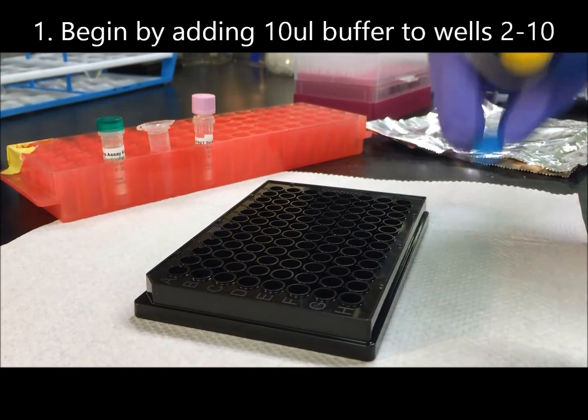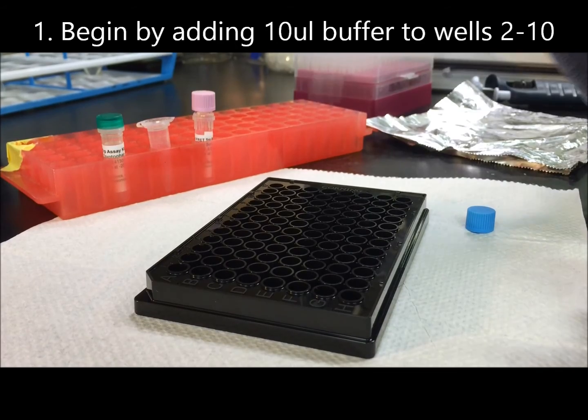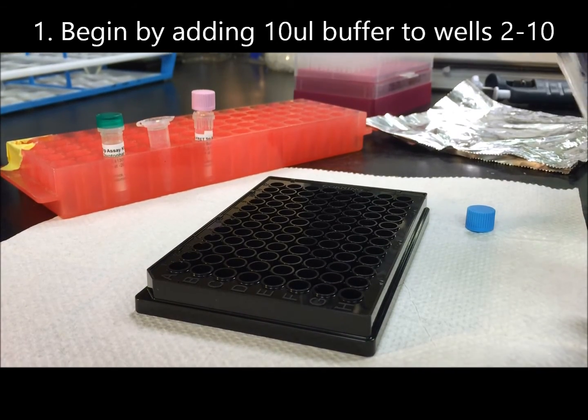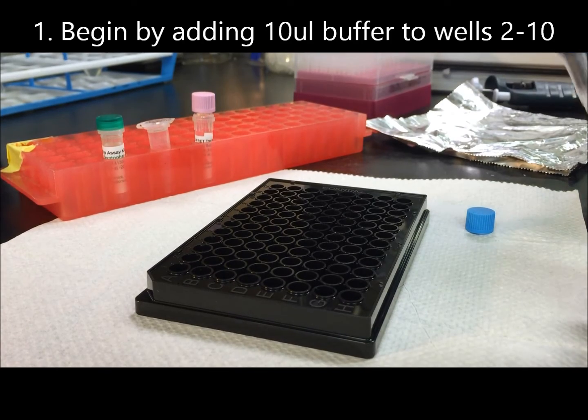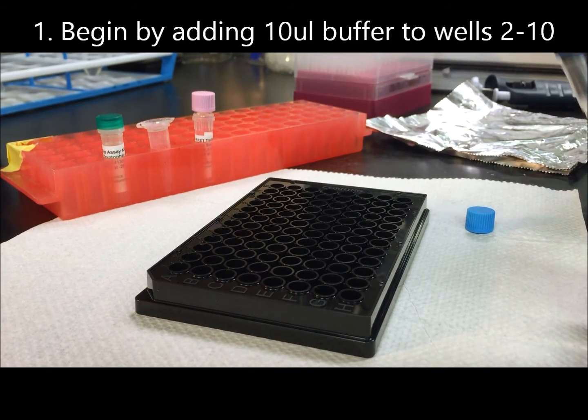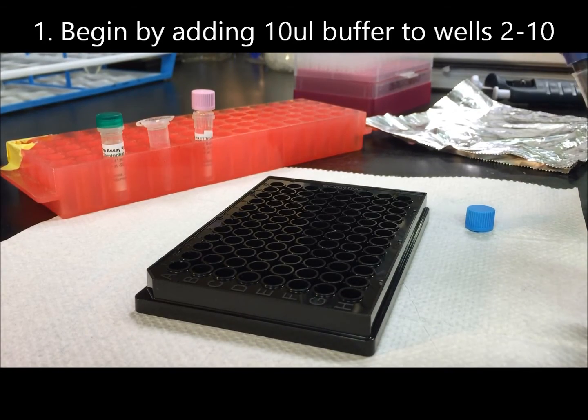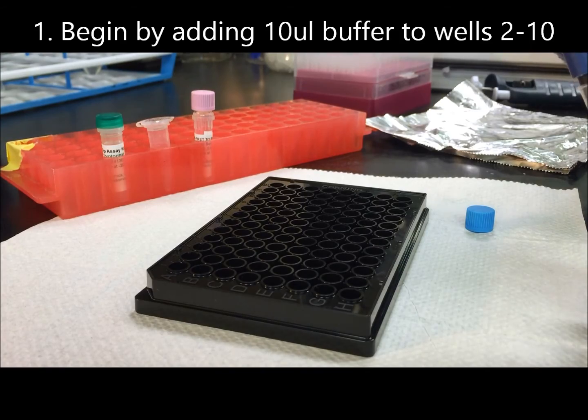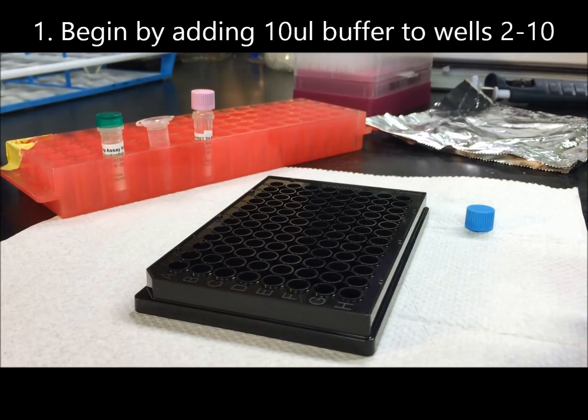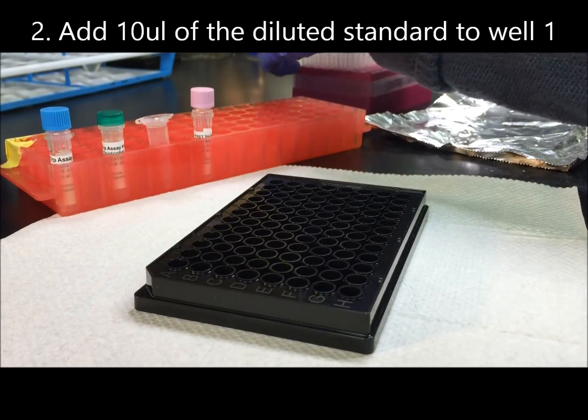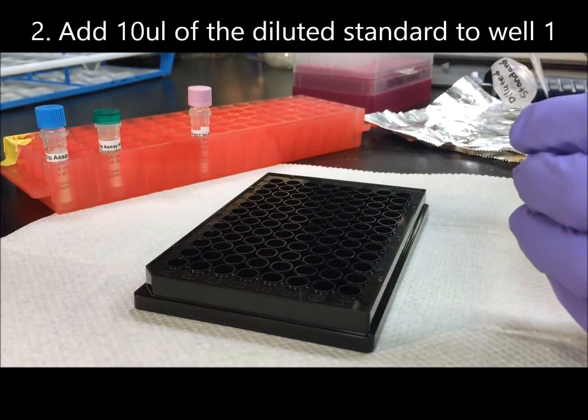Begin by adding 10 microliters of buffer to wells 2 through 10. Beforehand, you should have prepared a diluted standard according to the protocol. Add 10 microliters of this diluted standard to well 1.